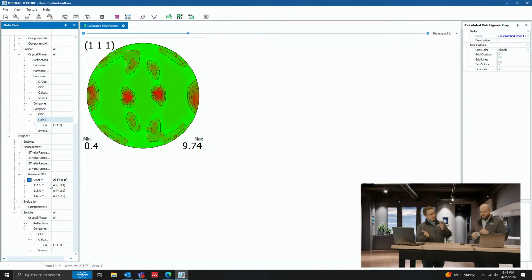As you go lower and lower, even with side tilt, you're going to have to shoot in the side of the sample. You run into beam issues and geometry problems. Yeah. So even if you can, the more robust approach truly is to collect multiple pole figures, refine against a single model, and then produce the total pole figure. Yeah, I agree. So even if your analysis is not ODFs, even if it's not inverse pole figures, if it is just saying, I want the pole figure, this is the smart way to get the whole pole figure. Yeah. All right. I totally agree.